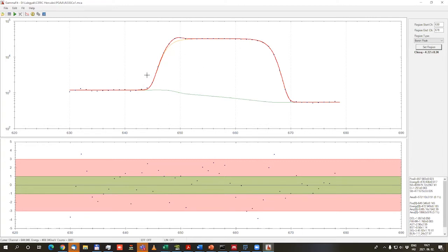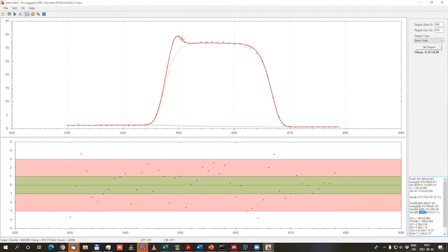And then we have the peak area of boron right here, separated from this tiny area which corresponds to sodium, which is shown here. And this is a logarithmic view, so if it's switched to linear view, then this is even more remarkable.